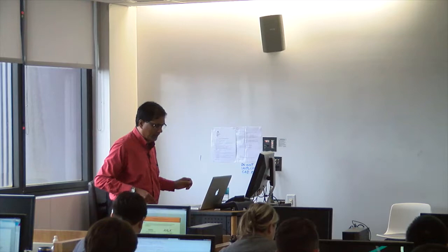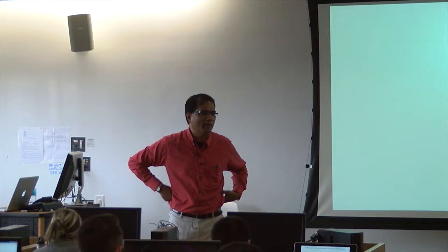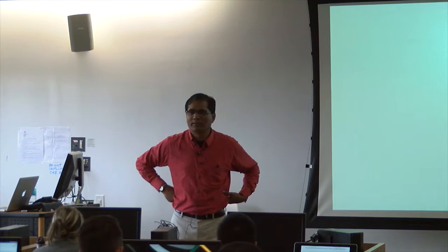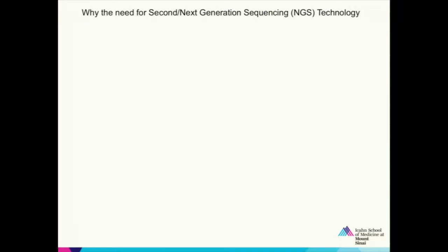Is it okay? So we just discussed microarrays, and that these microarray technologies were being applied in research, diagnostics, and other applied areas. At the same time, there was thinking about whether we could sequence another human genome. But the question now is, why do we need to sequence another human genome? The idea is good, but why? Microarray technology is doing well, right?